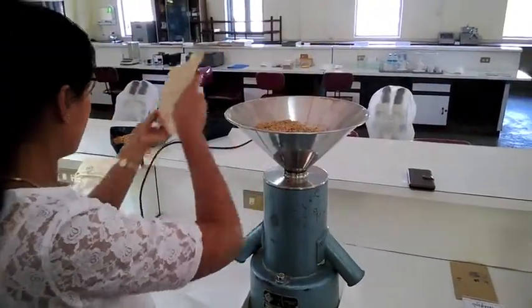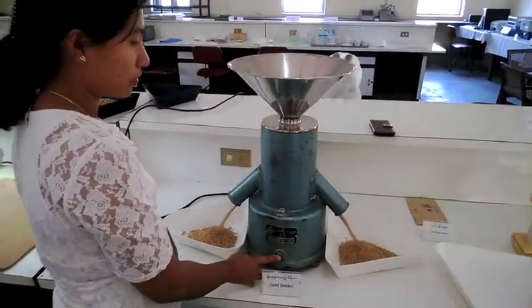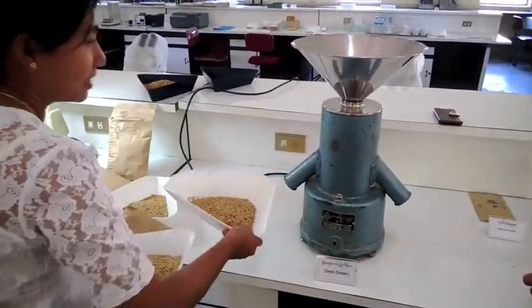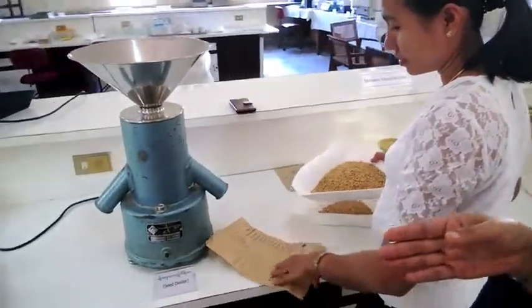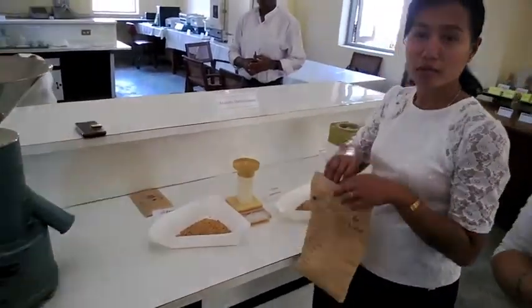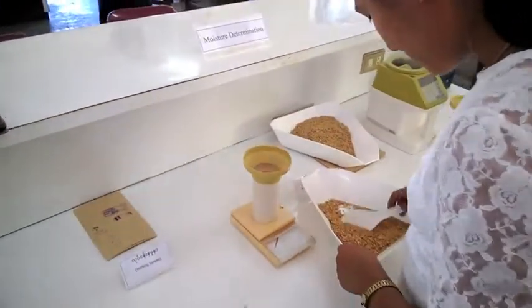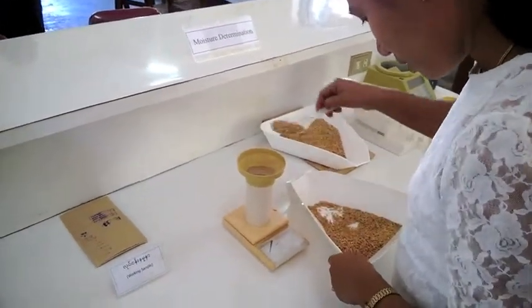They send 700 grams of the sample. Then you divide it into two, and we weigh 70 grams for the working sample. We measure 70 grams according to the ISTA standards, which are updated every four years.